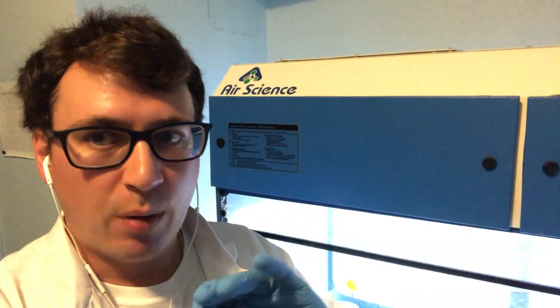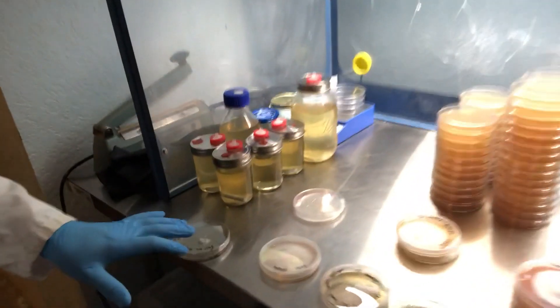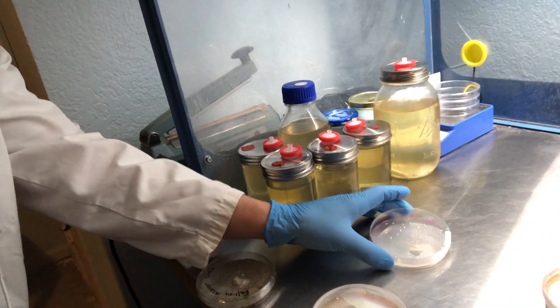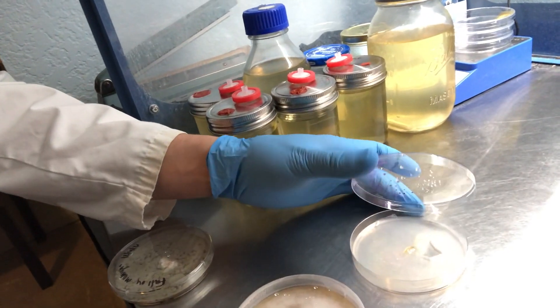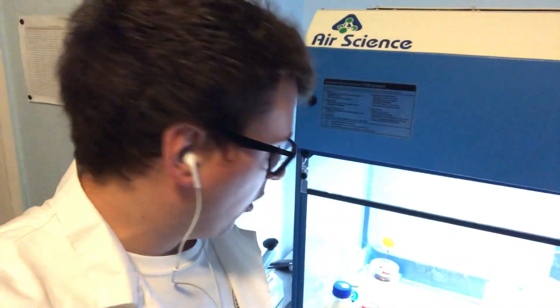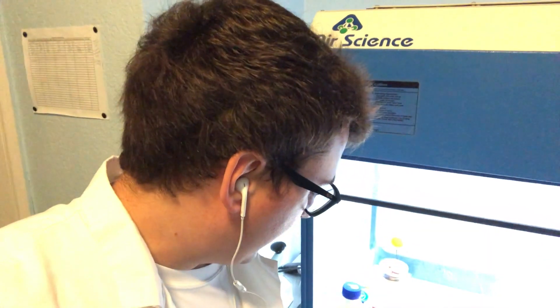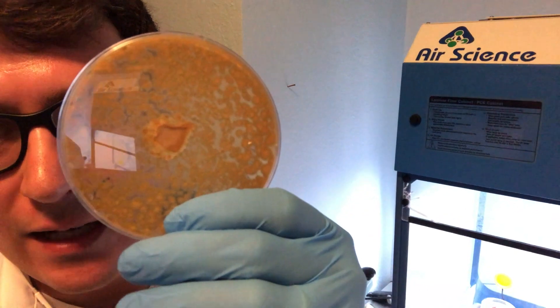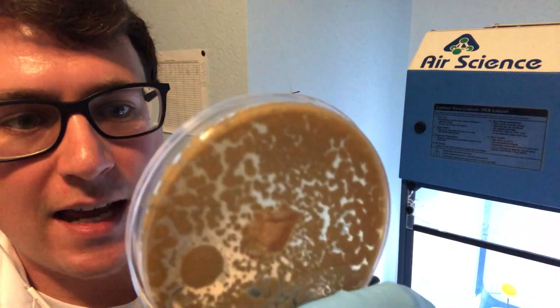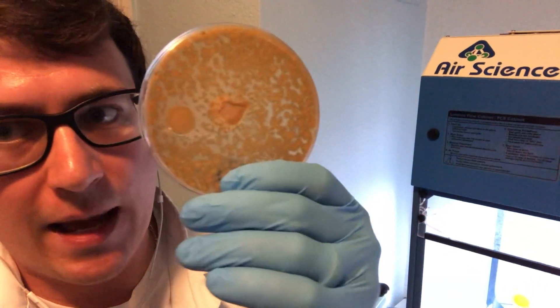You can see here, this is the original water agar plate from the clone that we received. If you remember, the mushroom was frozen at the time so I didn't have much hope, but we plated it out on water agar and also put it on MEA agar. This was the MEA plate and you can see very contaminated with trichoderma.